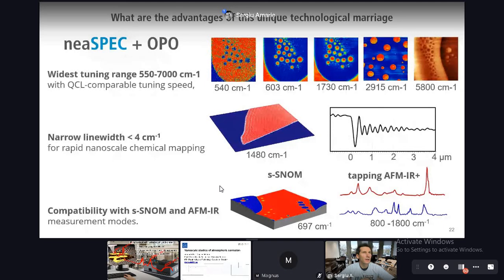And at the same time, if you want to have, let's say, a liquid cell, that's possible as well. There are, meanwhile, also some publications in that direction, both on polymers, but also on 2D materials. The way you do the liquid measurement is that you are not coming from the top and exciting the sample, but rather you need to come from below, because you do not want to go with the IR light through the liquid. Most or all of the IR light would then be absorbed.